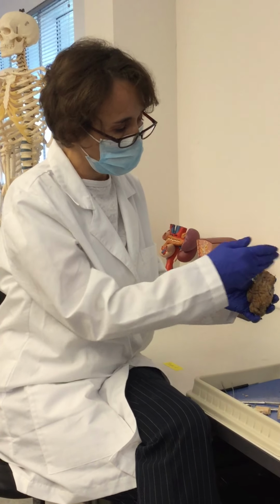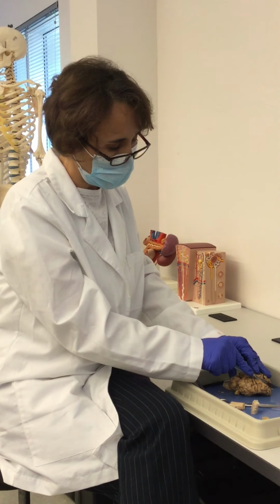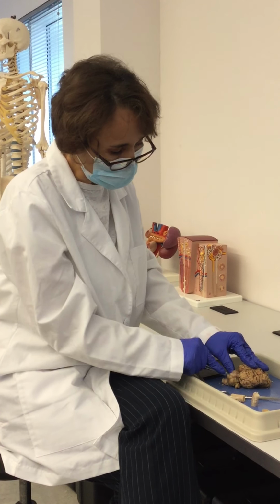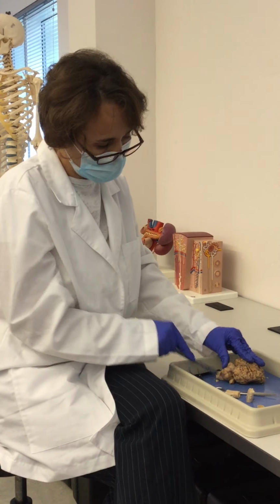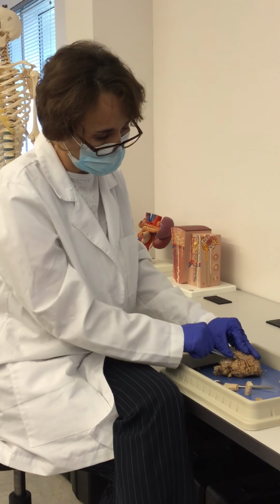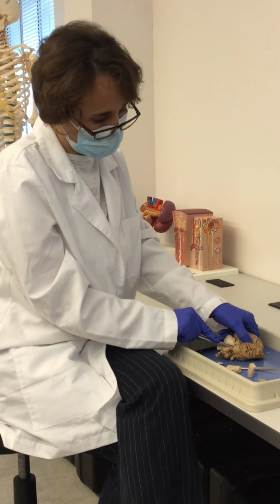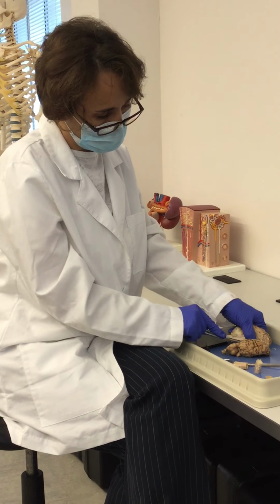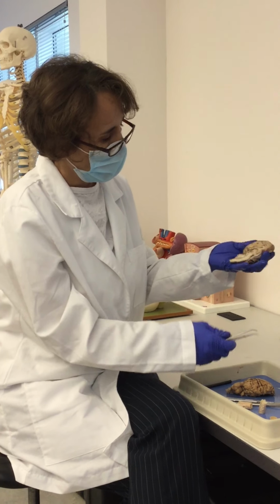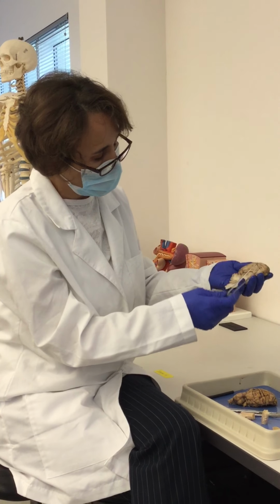Now I'm going to do this mid-sagittal section so we can see the internal structures of the brain. You do this using the scalpel, going deep into the longitudinal fissure, going all the way down, and this is what you can see.